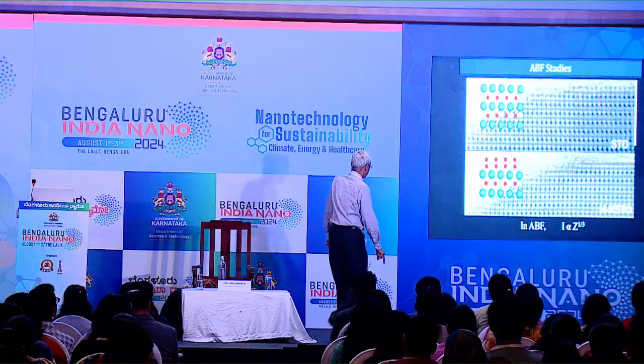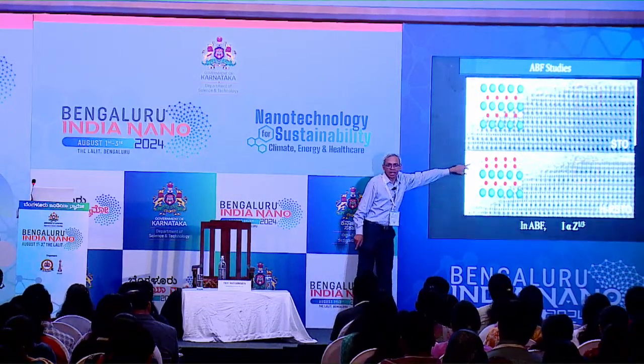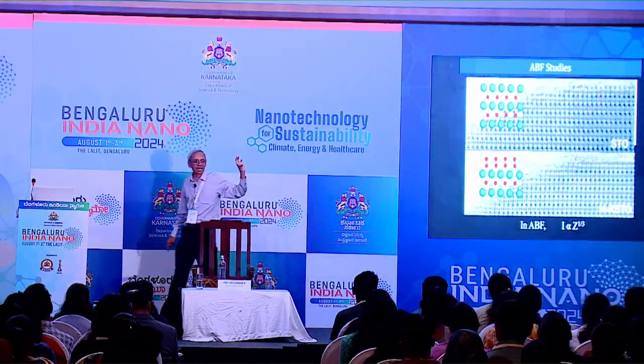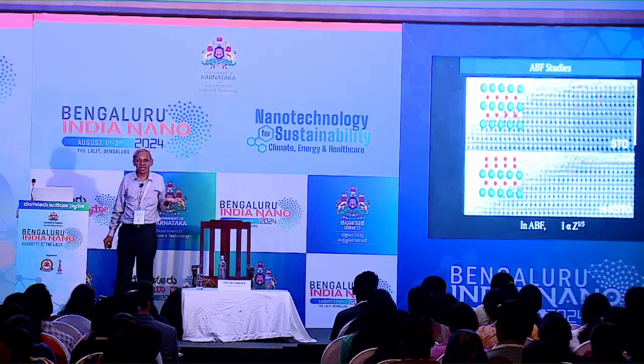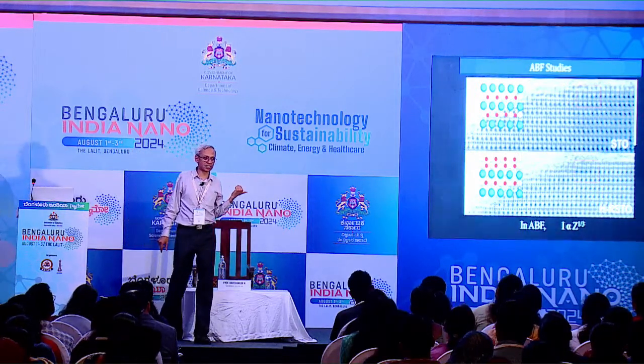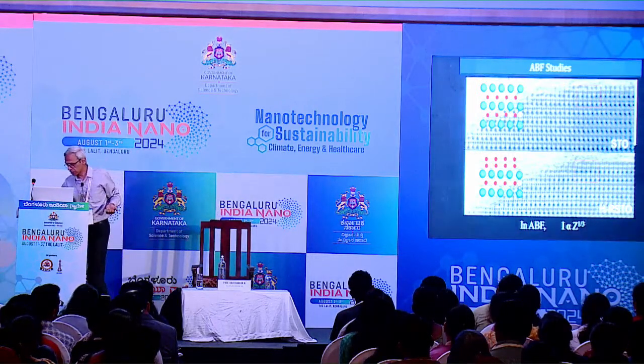The top two layers in the lower image here, right? This is a titanium oxygen layer, and structurally we are able to see that we form a layer of titanium oxide in these highly reduced cubes. But can we actually get spectroscopic proof to show that it's actually TiO, where Ti is present in the +2 oxidation state? We can do that by doing electron energy loss spectroscopy.